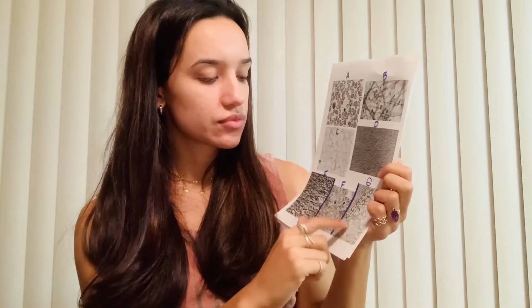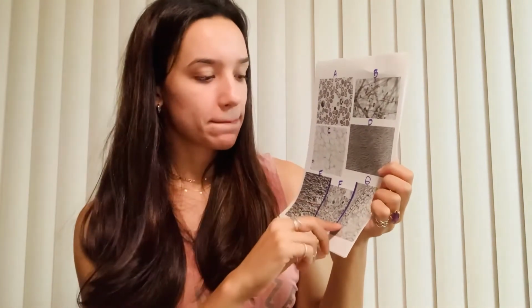Lastly, we have cartilage connective tissue, and cartilage connective tissue is made from chondrocytes. Cartilage is found in the nose and in the ears and in the airway, and the main purpose of it is to be flexible as well as keep the shape and form of different airways and pathways in the body.